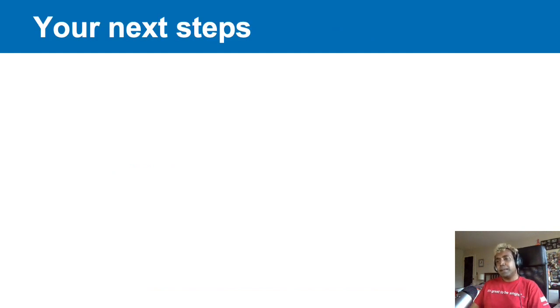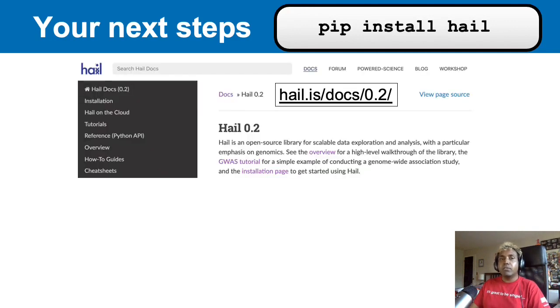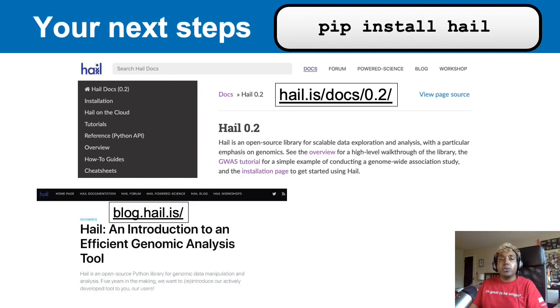So what would be your next steps? To summarize, really, pip install Hail is one of your first lines of code. Secondly, read the documentation. We've written as many documentation pages as we have. If you have any suggestions on how to make it easier, or if something was confusing for you, feel free to reach out to me personally and I'll take care of that. So the website address is hail.is/docs/0.2.